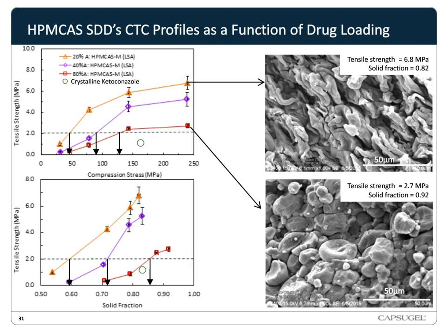And this is further corroborated by the SDD yield pressures. Although we measured them, they're not shown here, but the SDD yield pressures did increase with drug loading. And if we were to speculate what caused this, I think there are two things that cause this. One is the intrinsic material property. Obviously, one has a different ratio of drug and polymer, and when made amorphous and integrated into that material, they're going to have different properties.